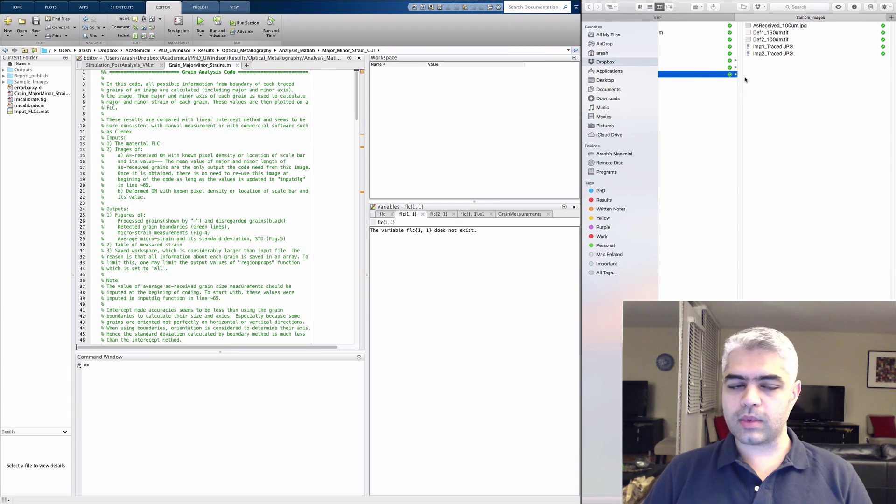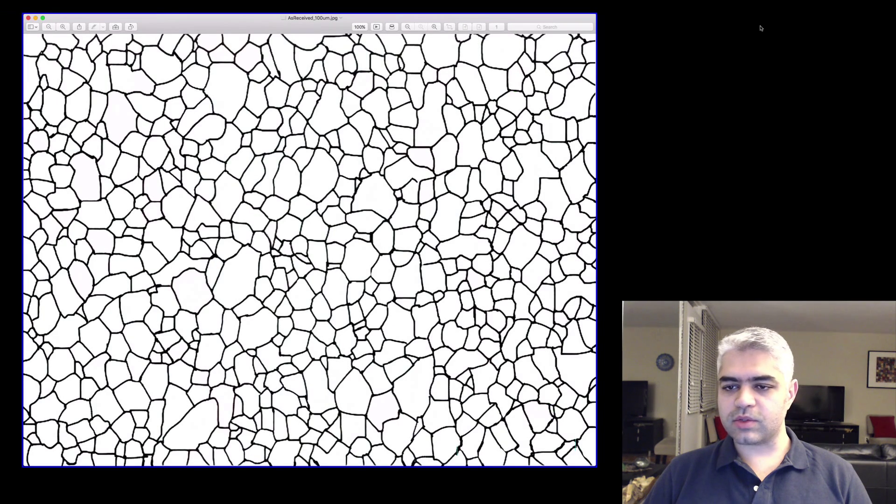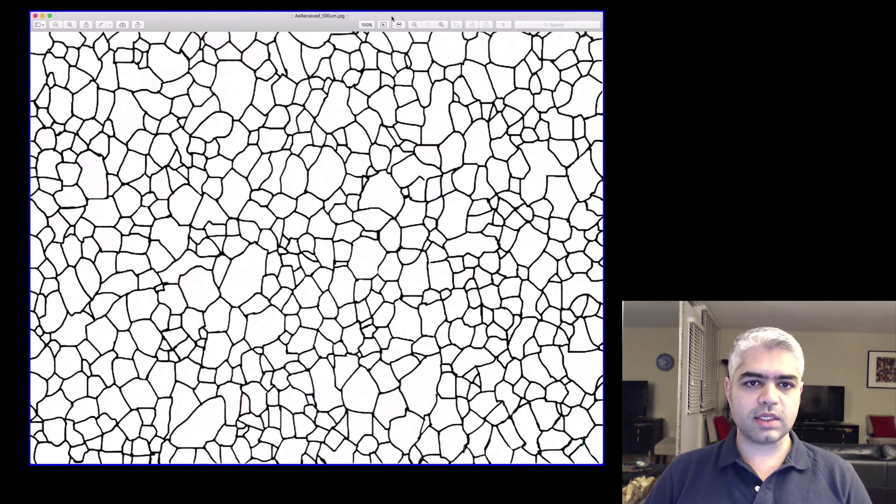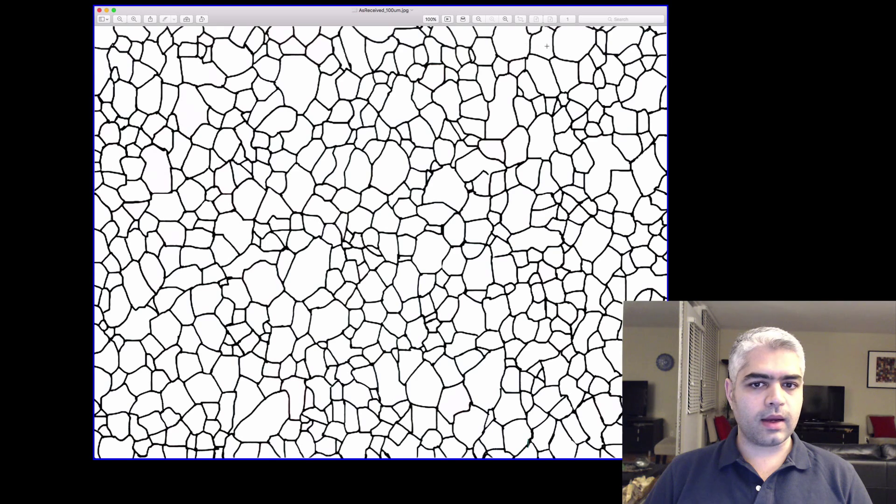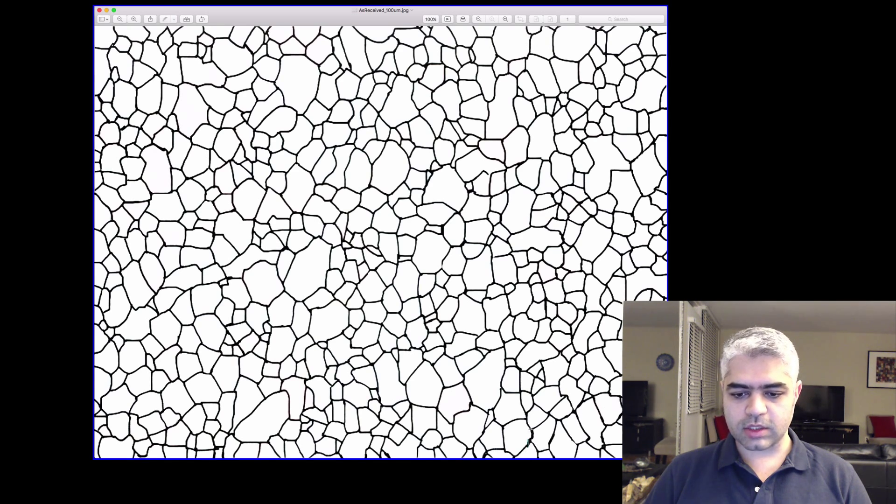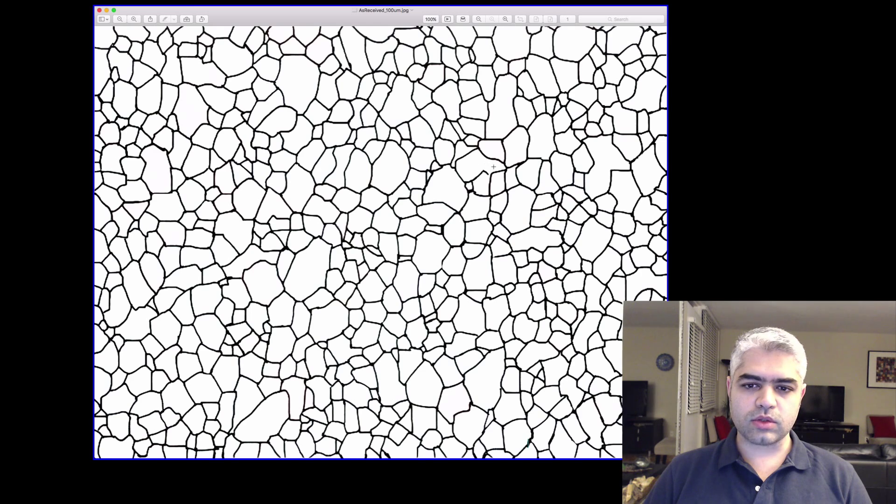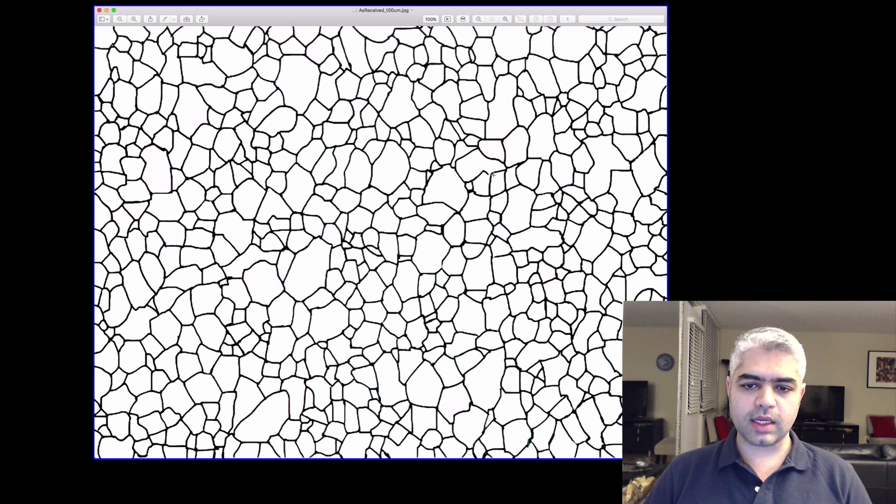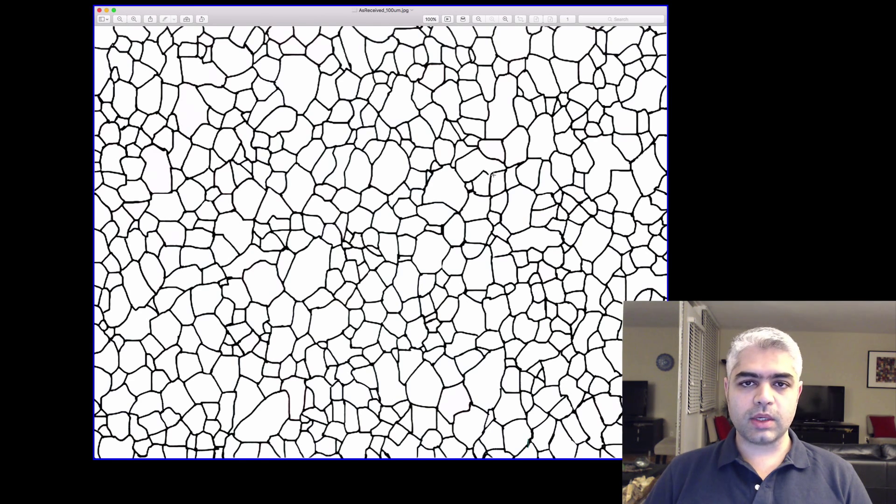You need to have your sample images saved somewhere. I have this image of the as-received material; you can see it here. Also, I have the length of the scale bar marked in my image, as you can see here and here. You need to be careful to post-process your image so that these grain boundaries are not connected.